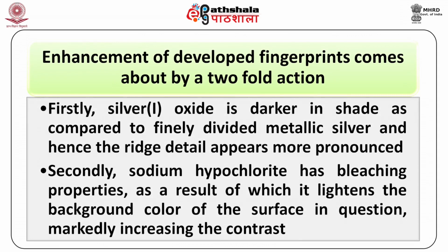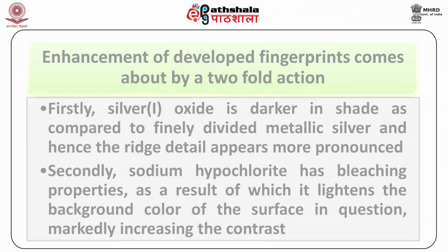The enhancement of developed fingerprints comes about by a twofold action. Firstly, silver oxide is darker in shade as compared to finely divided metallic silver. Hence, ridge detail appears more pronounced. Secondly, sodium hypochlorite has bleaching properties, as a result of which it lightens the background color of the surface in question, markedly increasing the contrast.